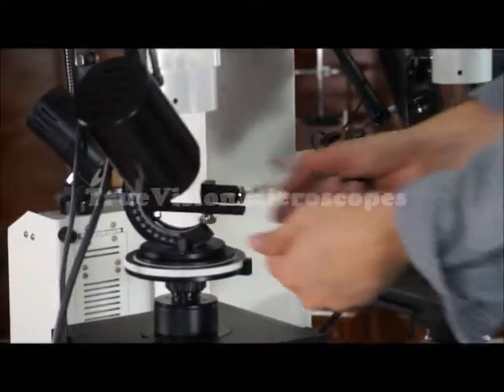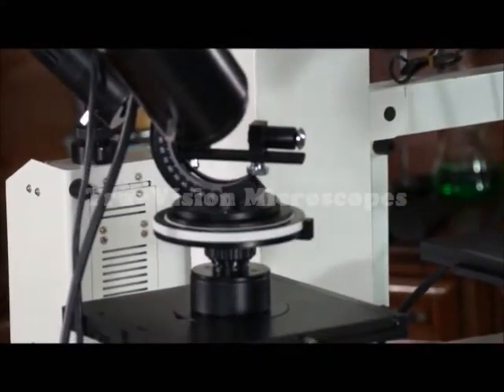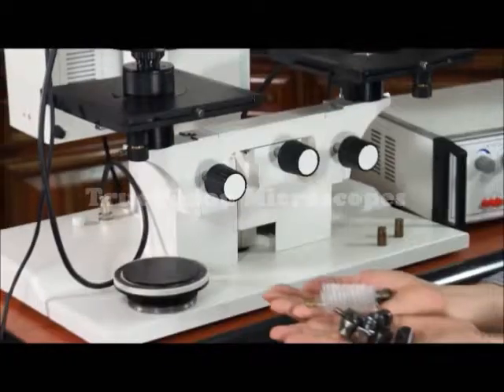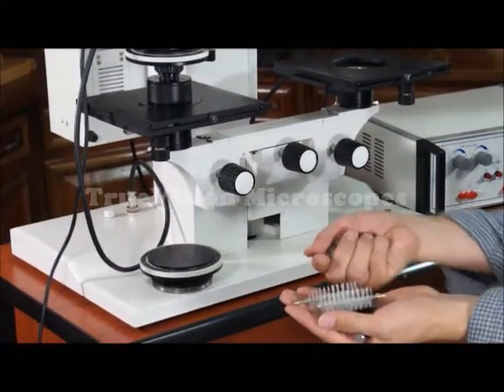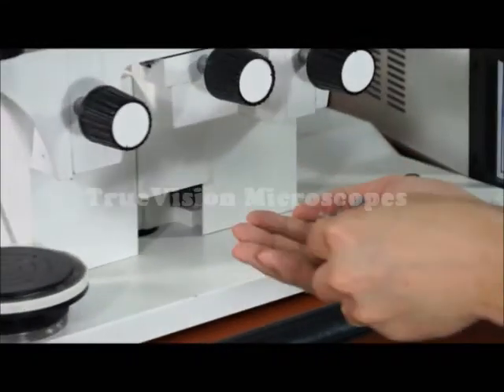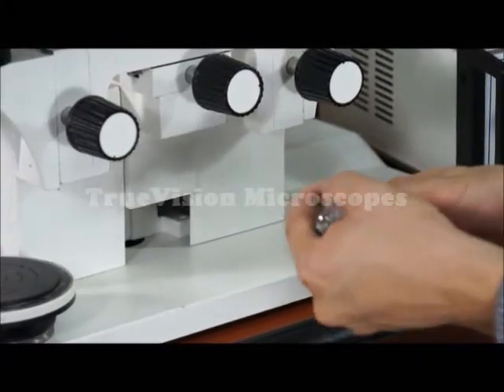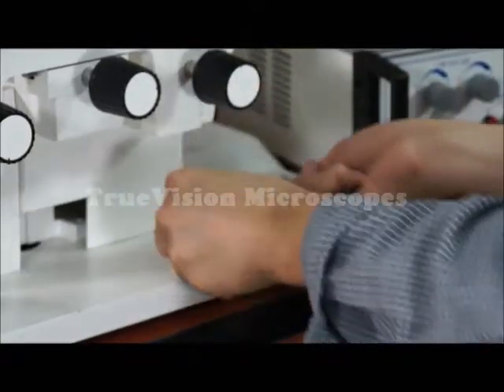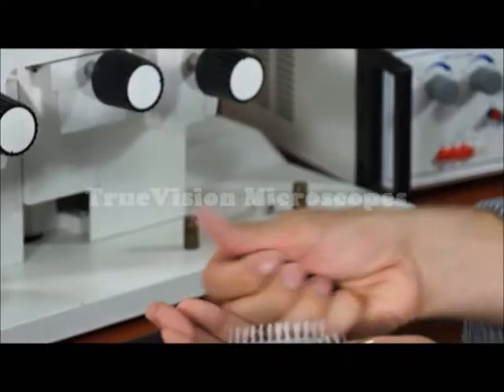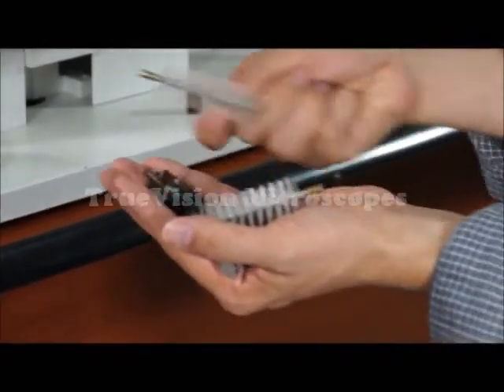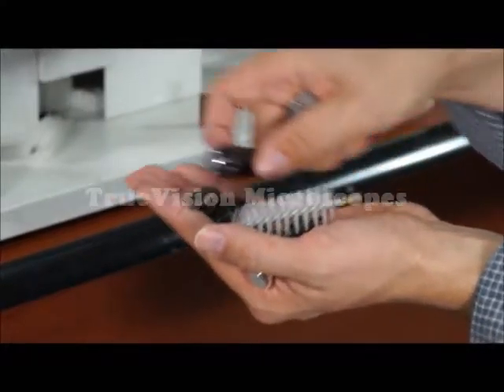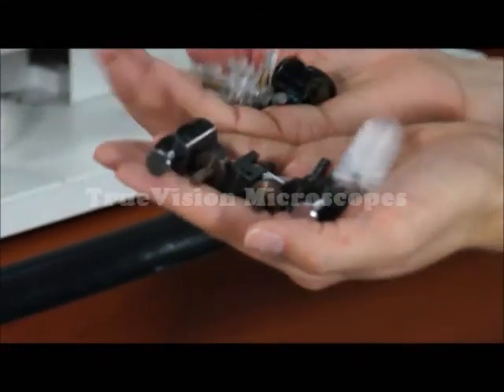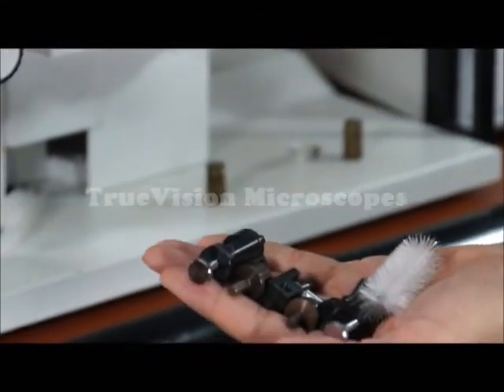For the bullet holder, we have a variety of accessories. These accessories are for holding cartridges, or for holding other bullets. Small bullets would be held in some of the smaller bullet holders. Just different accessories to use with our bullet holder.